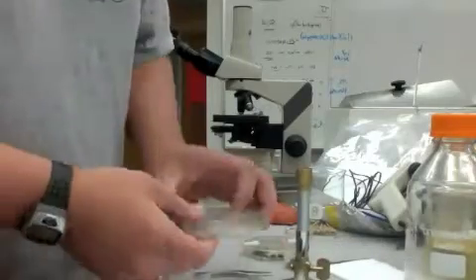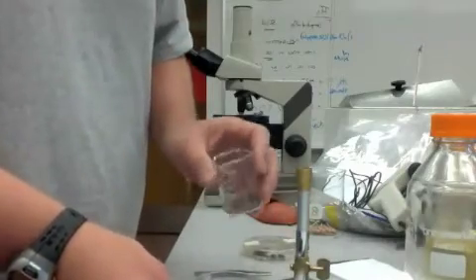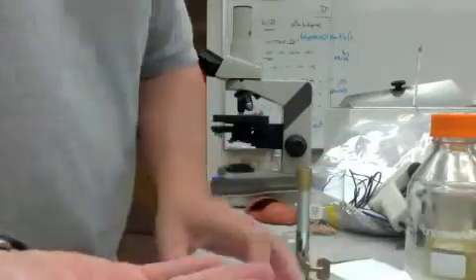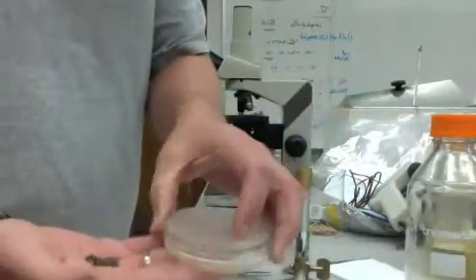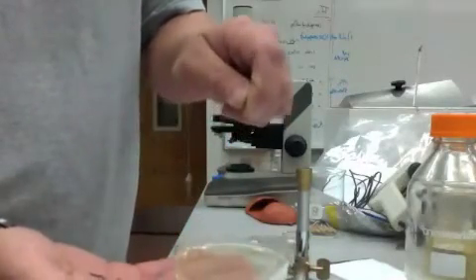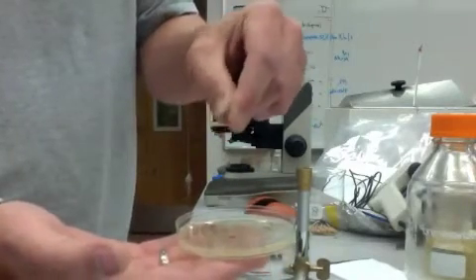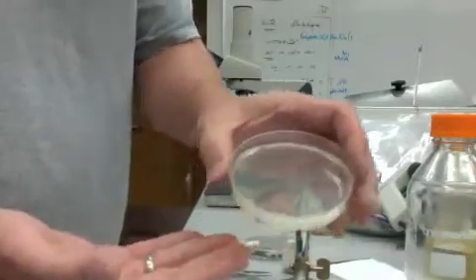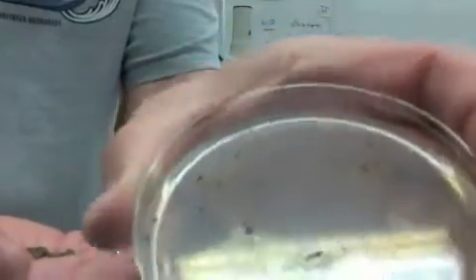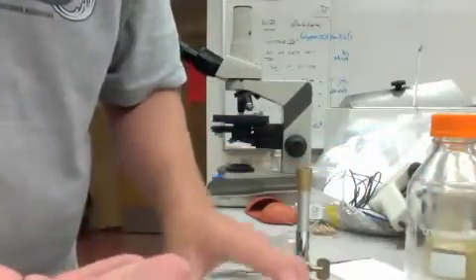Azotobacter, the only thing I want to demonstrate with Azotobacter or any of these isolations is this process called peppering. So here's my soil sample, my supposed soil sample, and here's my Ashby's plate. Now when I say pepper, you do this with Azotobacter and with Myxos, I literally mean dropping a little bit on the surface of the plate so that you have a few little bits of soil on there. I don't know if you can see this, but there isn't a lot on there, and yet there's plenty, and that's a peppered plate. So you can use that for, at least for Myxos and Azotobacter, when you come to it.